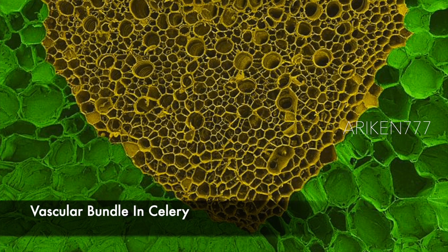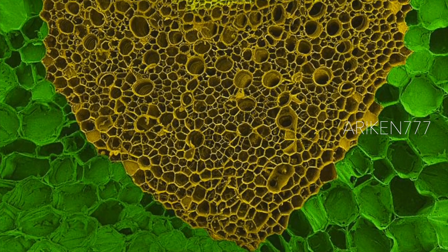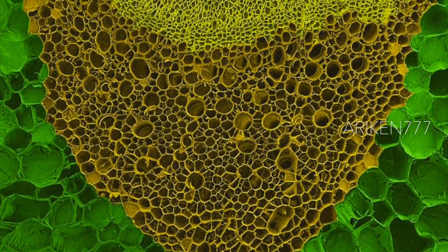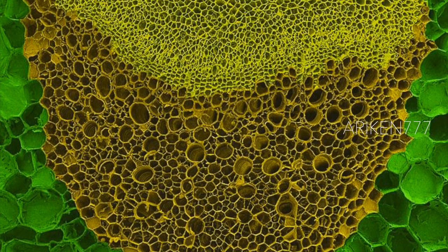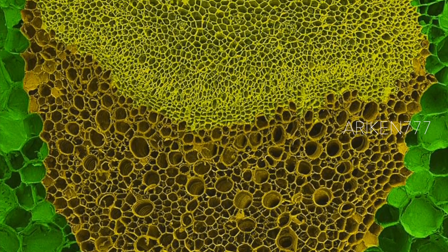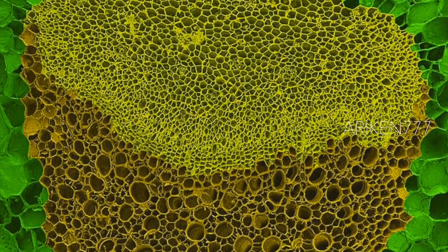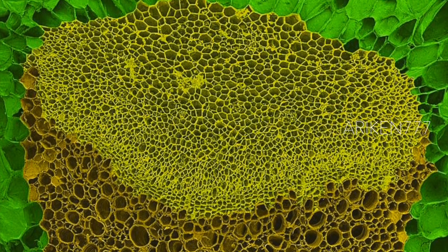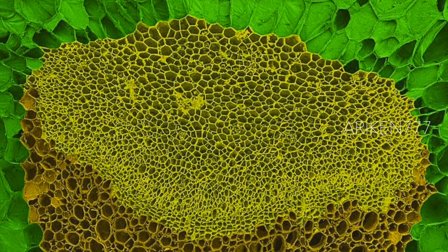Vascular bundle in celery. Celery stalks have numerous vascular bundles which act as a transport system. Shown here is a single vascular bundle in a celery stalk. The vascular bundle contains two types of conductive tissue: phloem, seen in the top area, and xylem, in the lower area. Phloem is tissue that transports larger organic molecules through the plant. Xylem is tissue responsible for transporting water and nutrients through the plant.